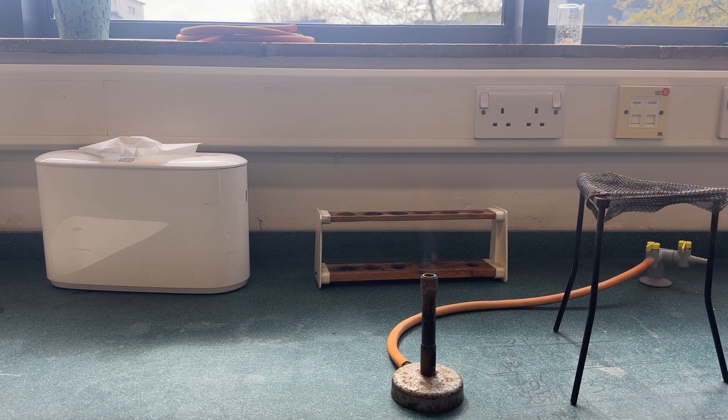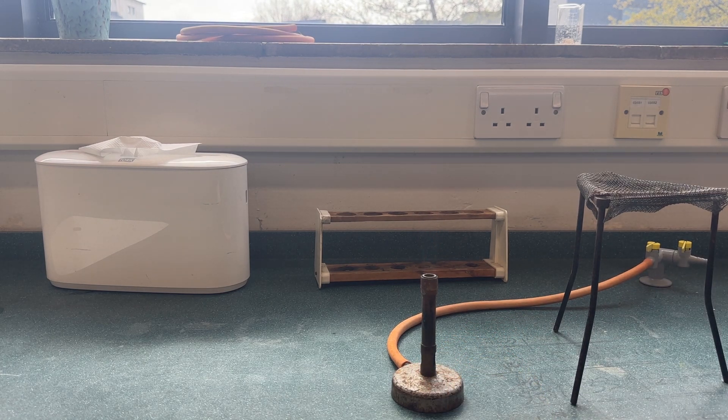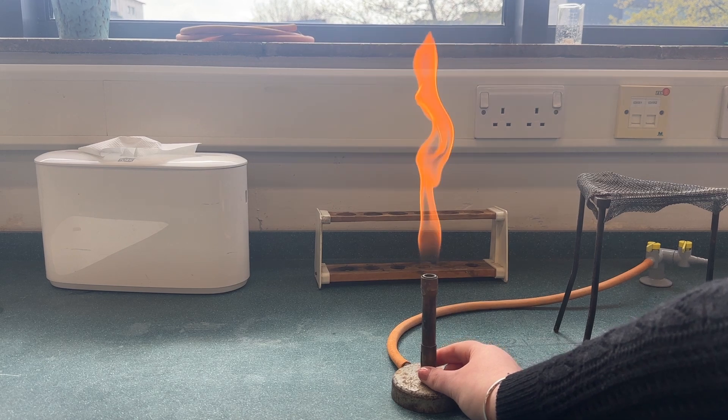If we half open the air hole then we get the blue flame. This can be used for heating liquids, and with the air hole fully open we have the roaring flame. This can be used for heating solids.